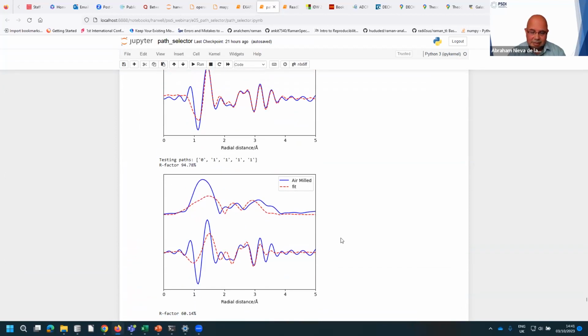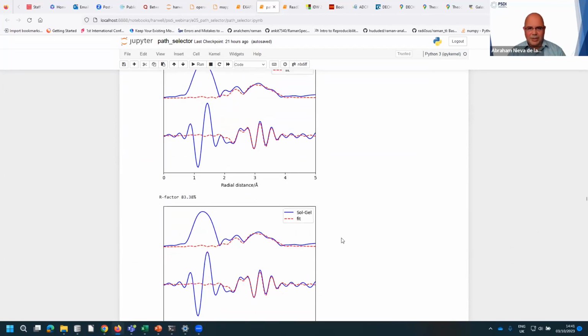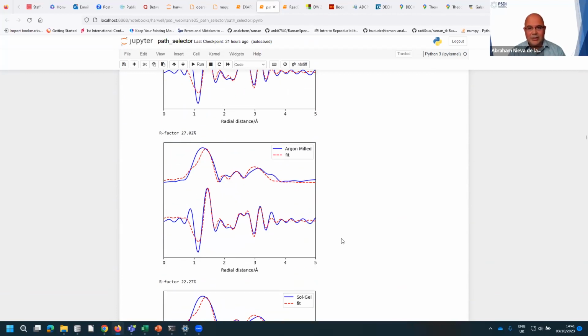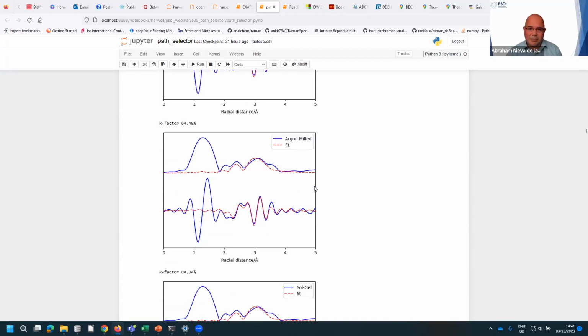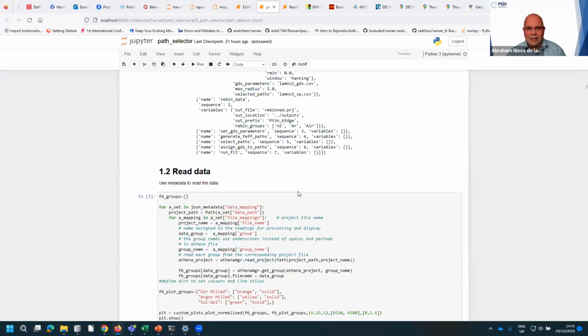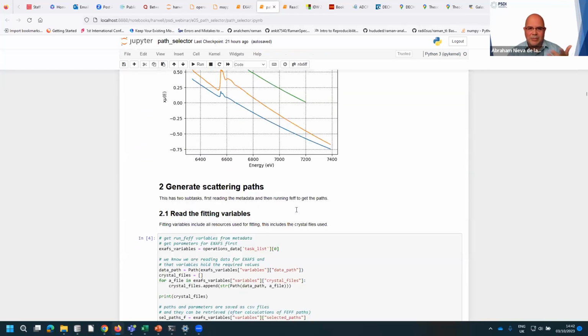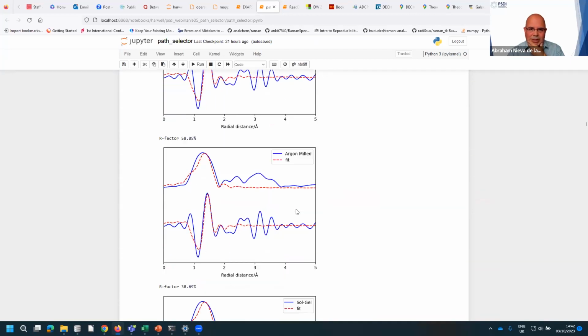And we can even do it for larger numbers of crystals, like testing with 5 or 6 crystals to see which crystals better reflect our sample. This is an idea that I got from Khaled Mohammed. I don't know if he's in the chat, but he was giving me an example where he would need something similar to this just to speed up his analysis.